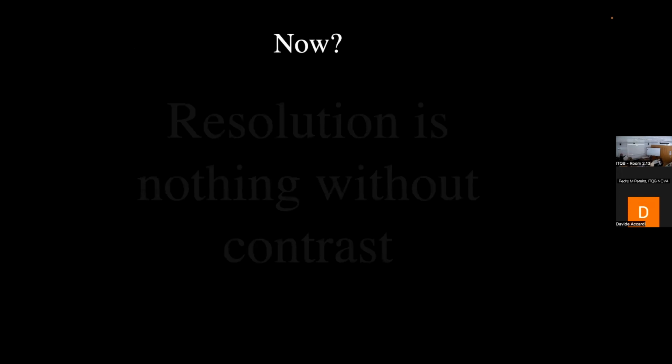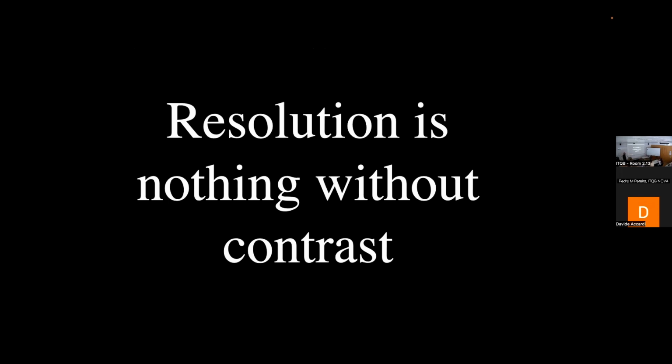What I want to tell you about is contrast, because contrast is extremely important in image formation, and it limits resolution. When Peter Evans was saying that resolution is the most important thing, and it's limited by diffraction, that is true, but contrast is extremely important too. Do you read anything there? And now, do you read anything? No. And here, okay, resolution is nothing without contrast. These letters are not small. They were there also before in the first line, but you were not able to resolve them and see them because there was no contrast. So resolution is limited by diffraction, but it's also limited by contrast.